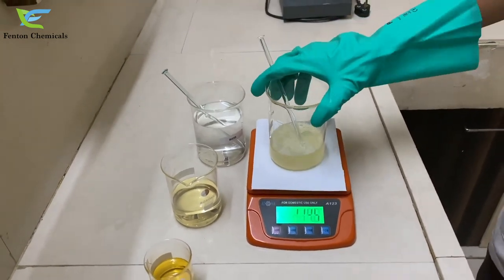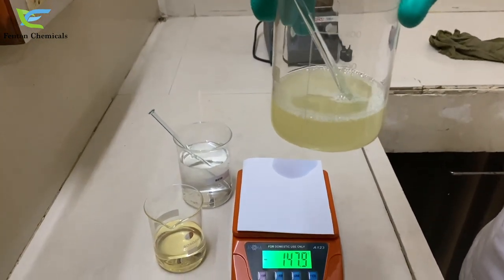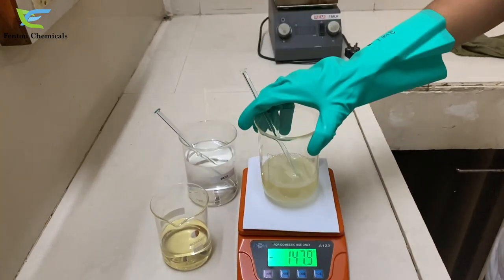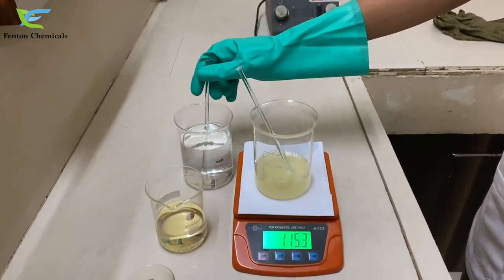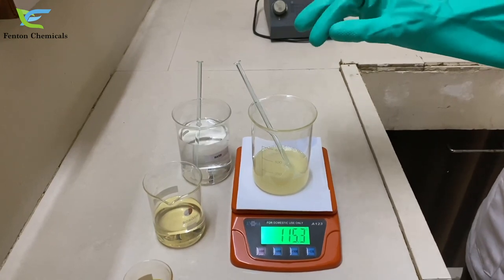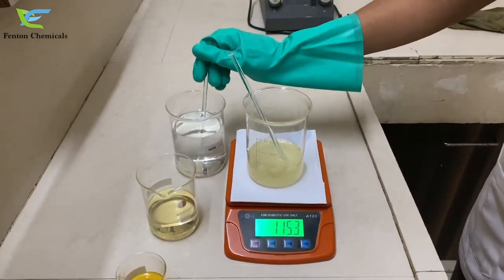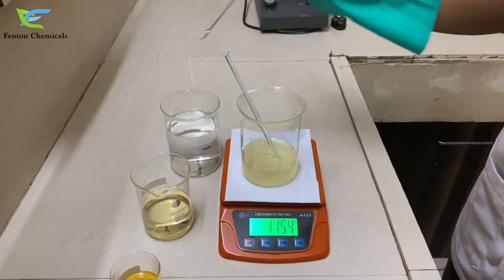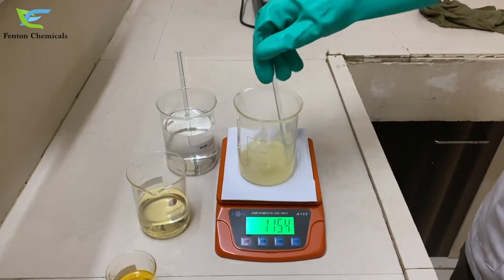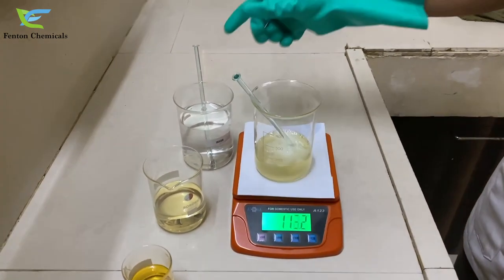Sometimes what happens is you do not get a crystal clear emulsion. So what we need to do is add a few drops of water to it to get a clear solution.